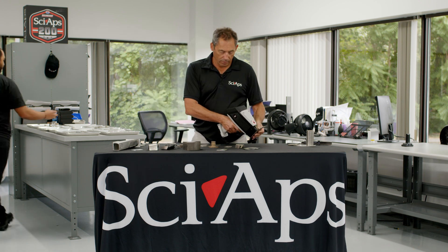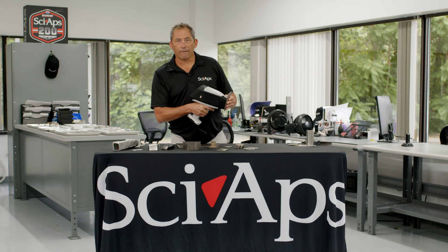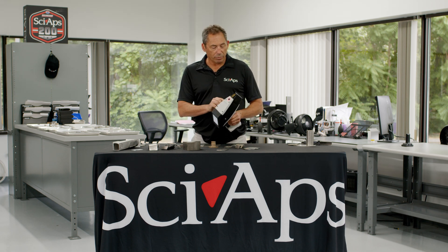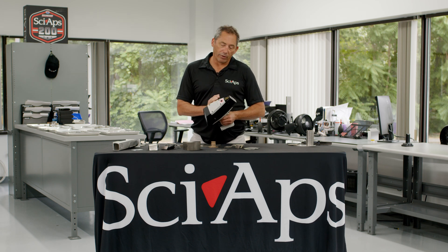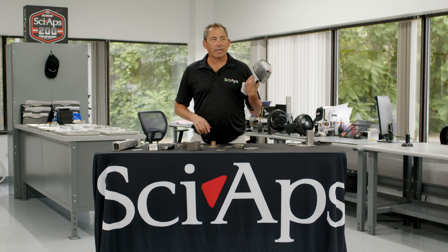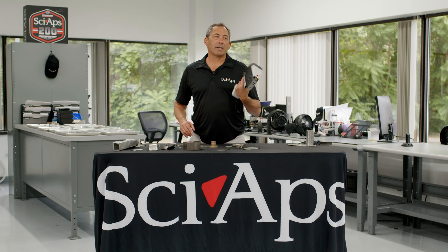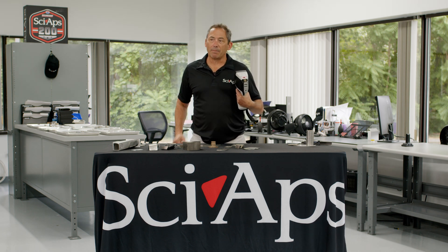You hear that noise? It's not just a laser — there's a fan in there that runs, and that fan is blowing air out through here, blowing any of the ablated material out of the analyzer so it's not accumulating on the optics. So even in a dirty environment or with oily samples, you're not going to be contaminating your optics, which means lower maintenance, no drift correction, and just good stable operation.